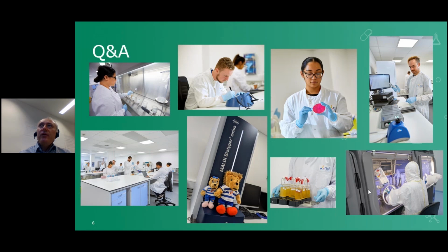and often, if you think of chemical as mostly associated with the act of cleaning, then if you're trying to remove chemical impurities, often you're trying to remove microorganisms as well. And there's an argument that if you haven't fully removed the chemicals, one, you might be creating opportunities for microbial growth, or you might be creating opportunities for microbial attachment, or you might be masking the microorganisms from the cleaning treatment. So they very much need to go hand in hand.